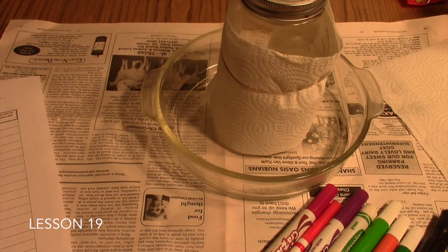This is the ink chromatography lab, which goes with lesson 19 in your friendly chemistry course. In this lab, your students will be taking inks apart and analyzing their constituent colors.